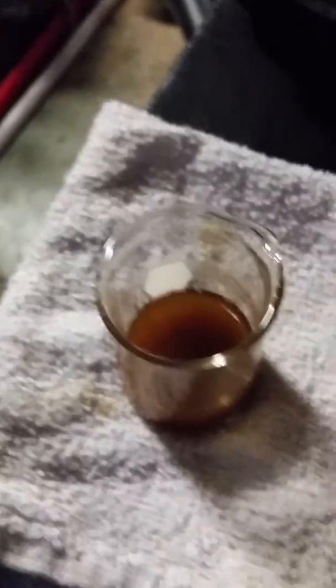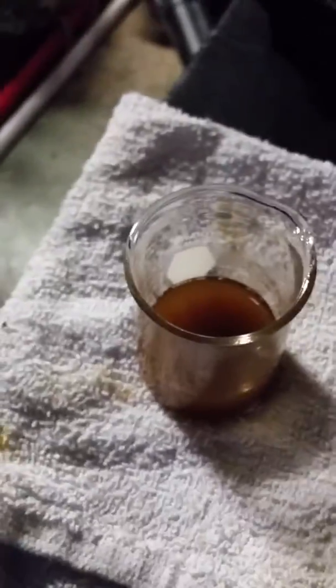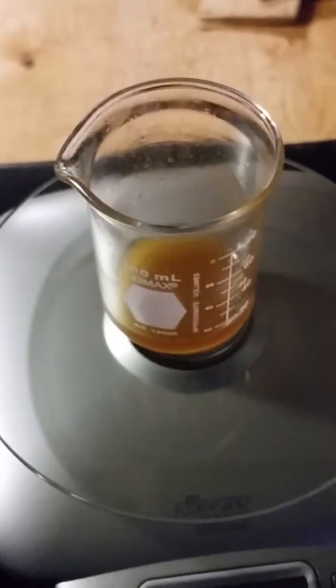Because the method calls for clean oil to test, I heat up my grease on a hot plate and let it sit for a while. Once it's good and hot, the water and fines go to the bottom. Then I put 7 grams of grease in this jar.